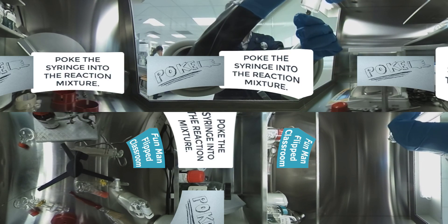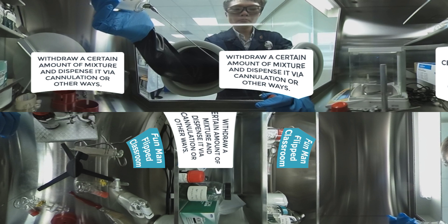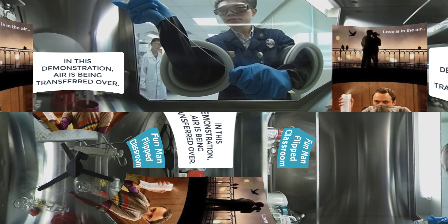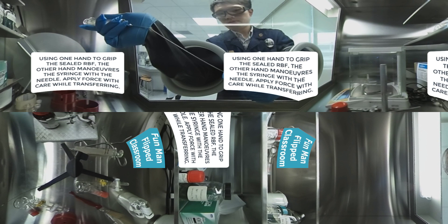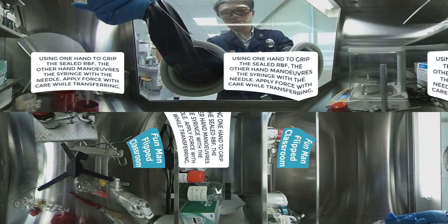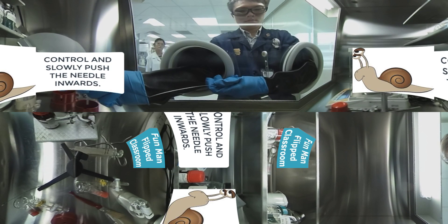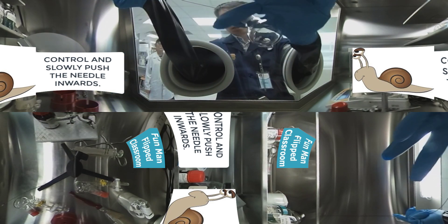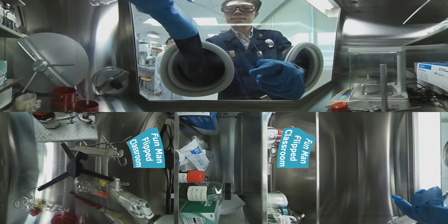Now we poke into the reaction mixture, withdraw a certain amount, and dispense it via cannulation or other means. Here I demonstrate a post-transfer of air into the reaction mixture. Using one hand to grip the sealed round bottom flask, the other hand maneuvers the syringe with the needle. Apply force with care, carefully with controlled pressure, and slowly push the needle inwards.